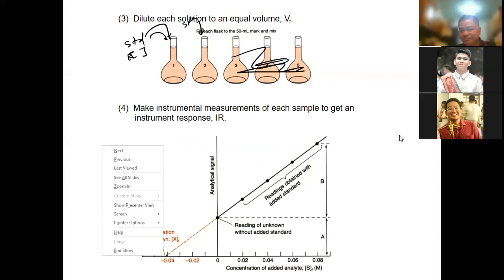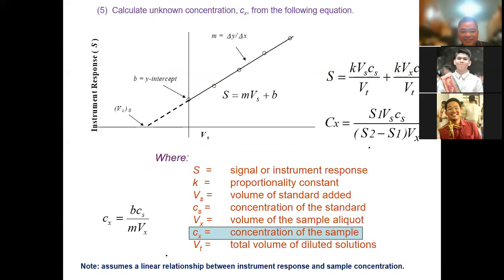Or you can just compare it, with single point standard addition, which I'm not going to do here. So the way that you're going to calculate the concentration is just like this. This is the one using the calibration curve, but I have told you, you can do a single point.